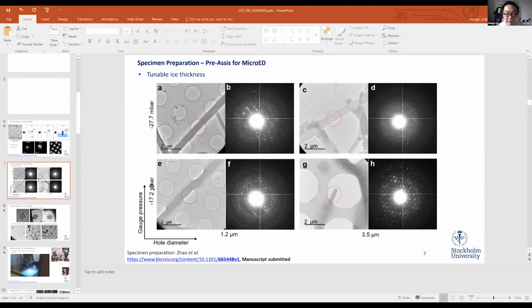But I think after using the seeding procedure, it's necessary to take some time for the crystals to recover. What we found was that when we crack crystals, the resolution was dramatically lowered. For example, if it diffracts to 1.8 angstrom in X-ray, when we crack the large crystal for micro-ED, it gets to about 4 angstrom resolution. So there is an effect in reducing the crystallinity. But I think different systems also behave differently, and it will be very interesting to try different systems and see how cracking would affect the crystals.